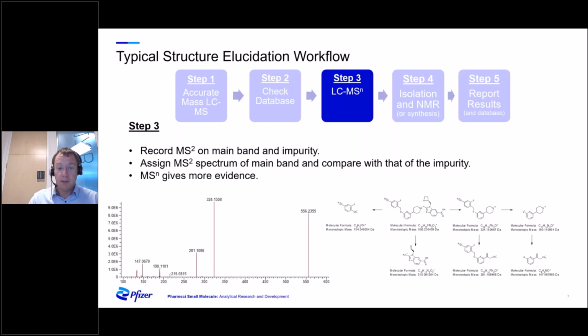For example, if you had an impurity that was an oxygen up on danuglipron here, say, then you could look at the fragmentation scheme and see which fragments were 16 heavier than the MSMS of danuglipron and isolate where on the structure this extra oxygen occurred. Often this, with a bit of chemical common sense, is enough to assign a structure to the balance of probability.